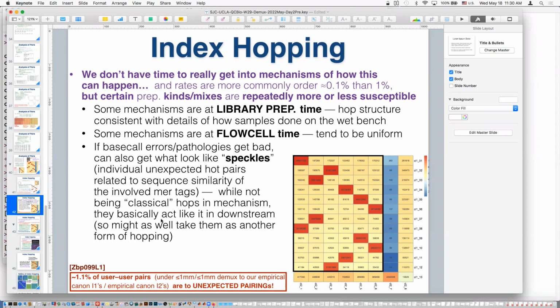But it turns out that for this particular pair of targets, they're only 1 indel away. So the generic target distance here is greater than 3, which is not great, not terrible. But maybe this particular pair has 1 indel mismatch, and all the other pairs are 2 indels away. So in a certain sense, in the all-targets pairings, these two are closer than anybody else.